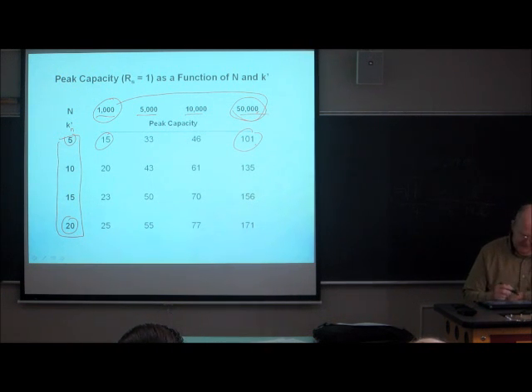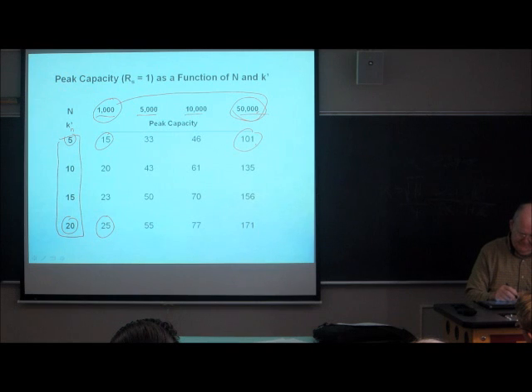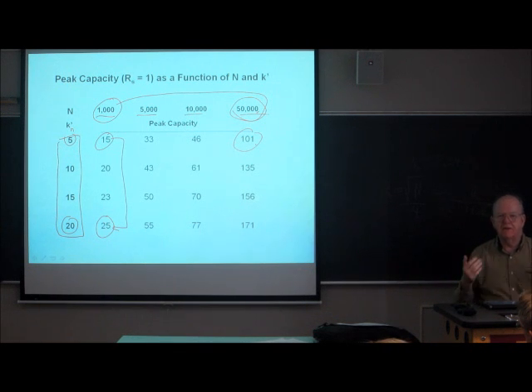If we go the other way, and keep the plate count constant but increase the K prime, we change from 5 to 20. It's going to take us 4 times longer to do the separation. Don't even double it. Not a happy camper. Spend 4 times as much time doing the darn separation, and you don't even double your peak capacity. It's really not a wonderful world.